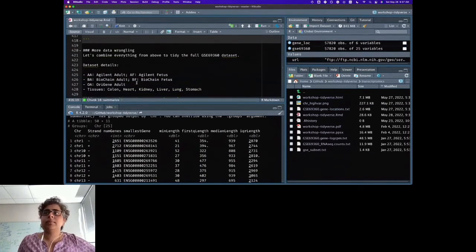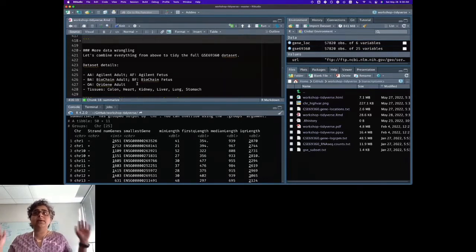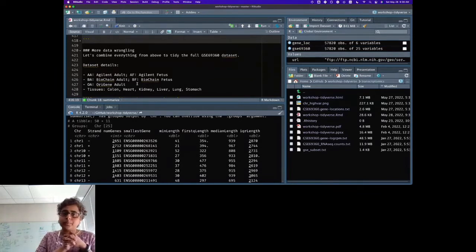That's great. All right, so let's do some more data wrangling now. The assumption is you're familiar with the basics of how to filter columns, how to filter rows, how to arrange, how to identify what are the distinct entries in each of the columns. You know how to group, how to summarize by groups, how to add these summary statistics. You know the basics of regular expression. Already you've learned quite a bit. Now let's see what more we can do with what you've learned so far.